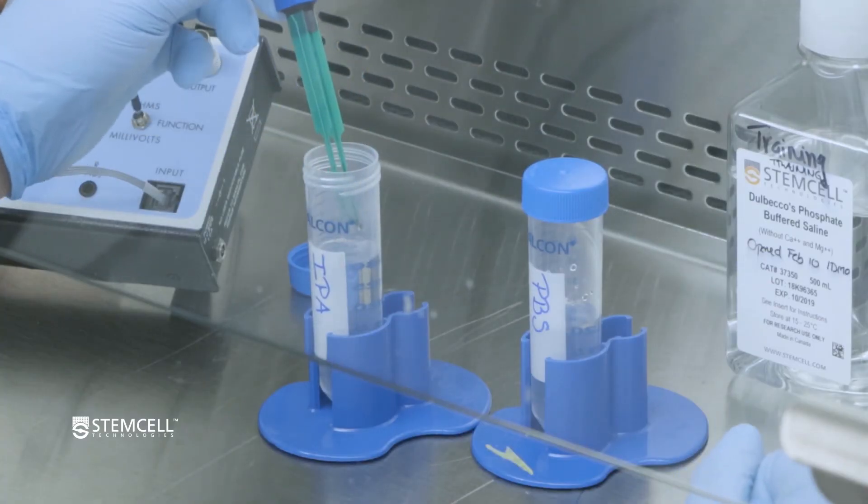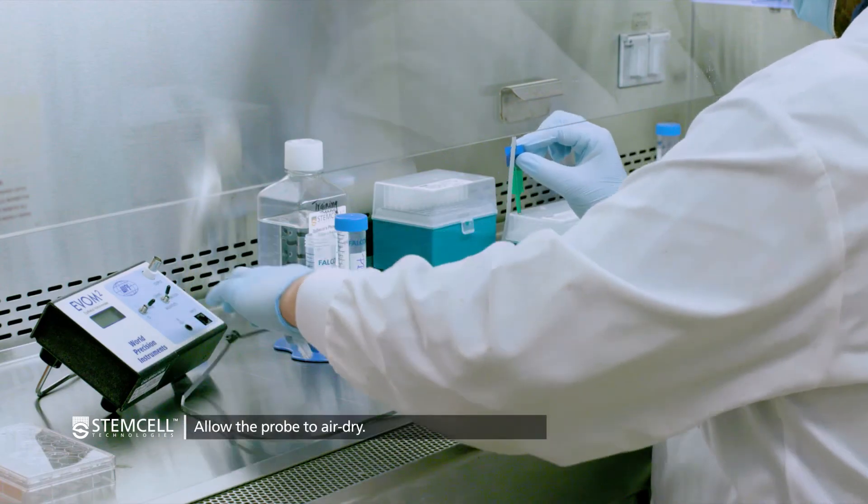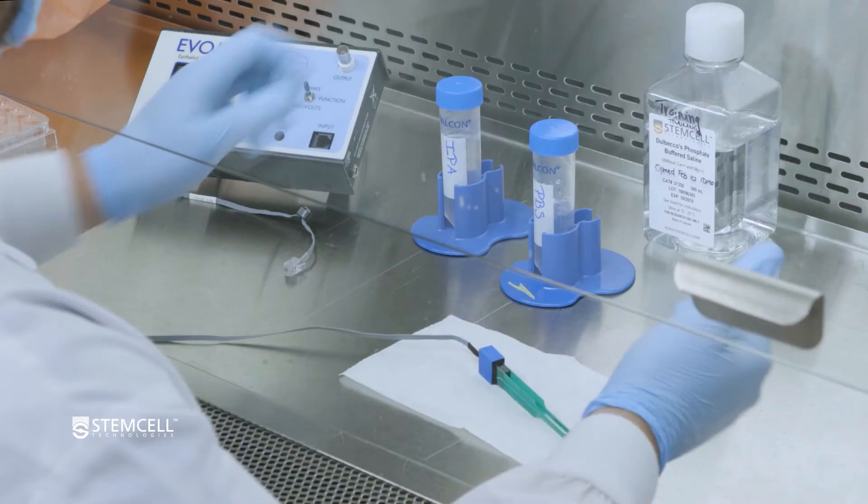Finally, remove the probe from the IPA, allowing the excess IPA to drip off the prongs. Disconnect the probe from the EVOM and allow it to air dry, then return the probe to its case.